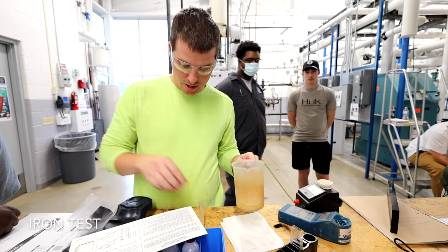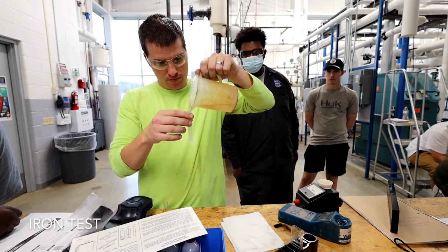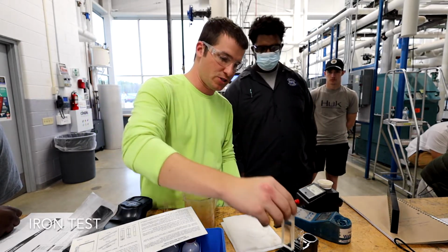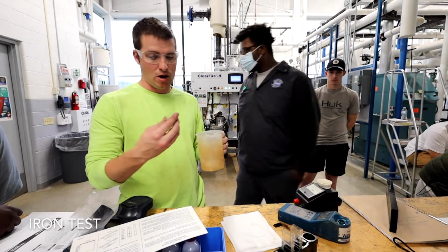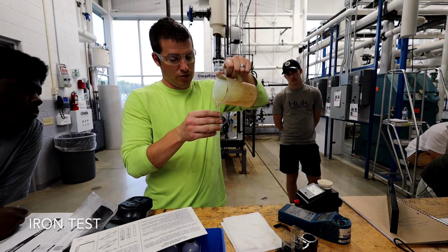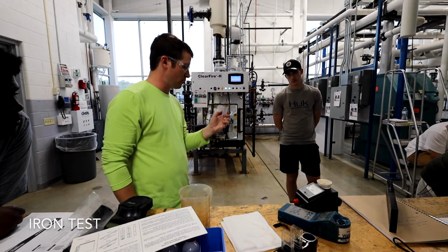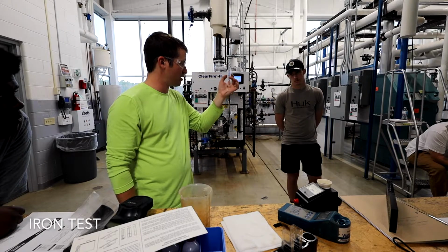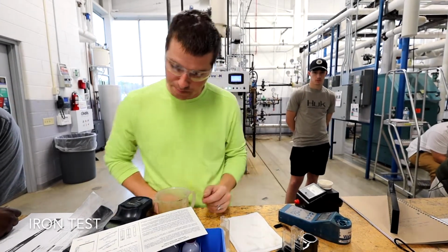Okay, so let's go ahead and fill up this one. Okay, to the 11.5 mil mark. I'm a little over it, but that's just a blank, so it's not really going to impact anything one way or the other. And then this one's going to be our sample where we're actually going to add the reagent. So this one I went a little over. The longer you do this, you learn the flick, right? So I can get it pretty accurate just by flicking out a little bit. So there's 11.5. That comes from doing it a long time.